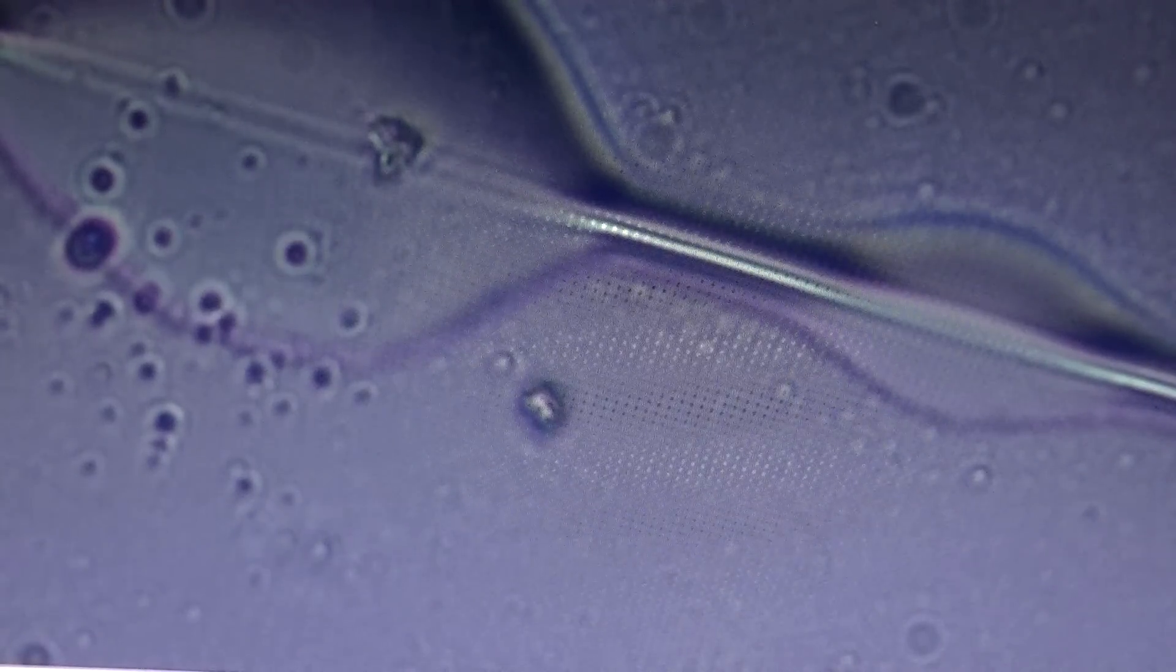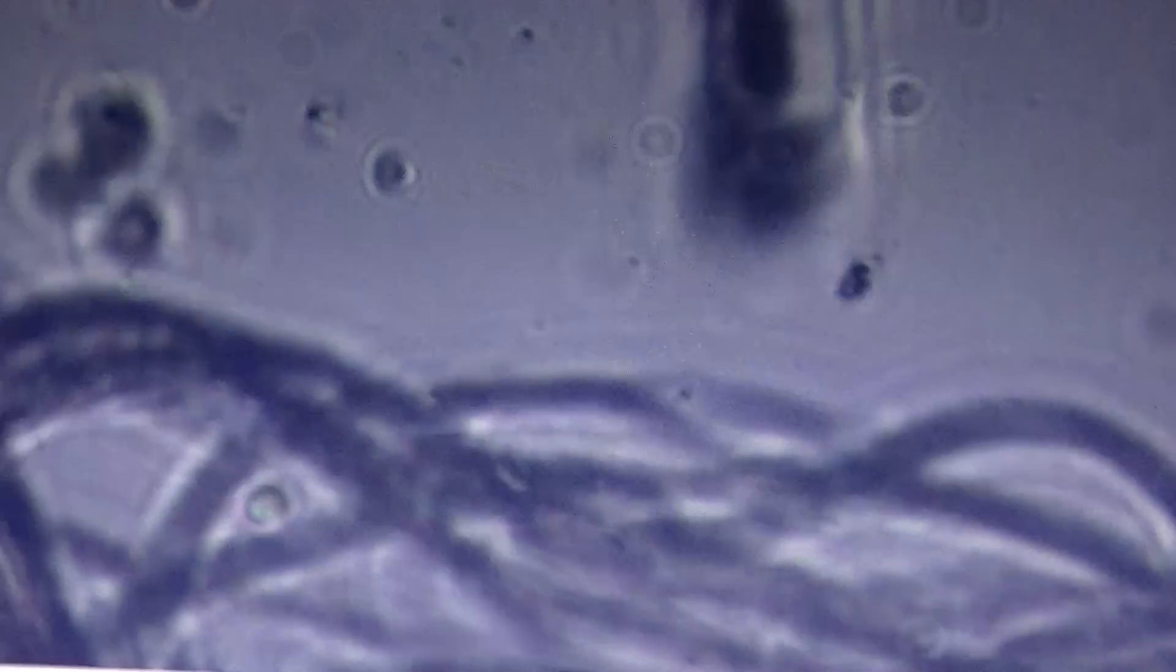Now let's look at the chemtrail fibers that showed up in the treetop that was in my video earlier. And I've got many of these samples. I went outside in the late afternoon, and in ten minutes I had six samples of this stuff. And just, it was globules just hanging off of different weeds and things. Okay, now here's, these are the actual fibers that showed up in the treetop. This stuff was all over the place today, here in Texas. And also I've got to mention, the humidity was 20% when all this was going on. So maybe it requires a low humidity.